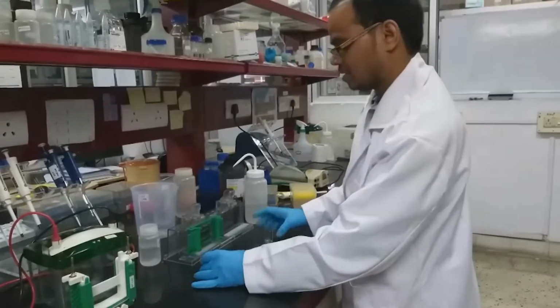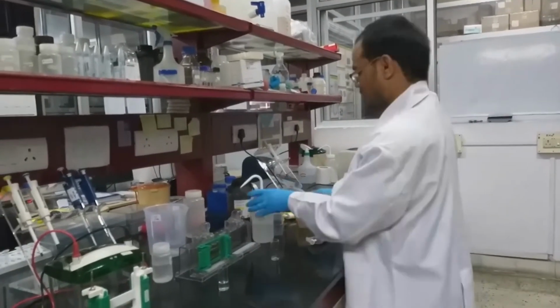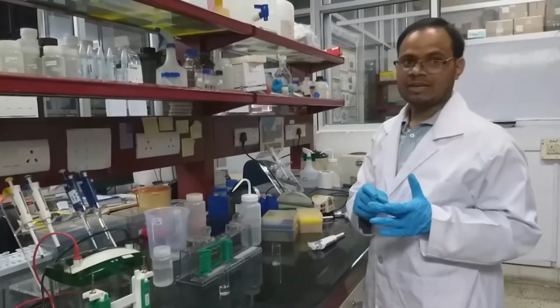So now we will start preparing the stacking gel. The compositions are given in the video.